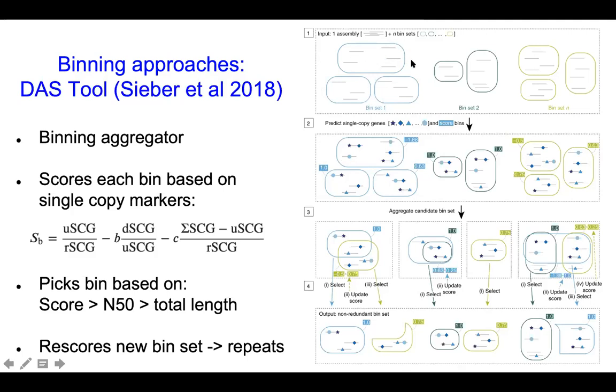The contigs are overlapping between different bins, right? There's one assembly that is then partitioned based on different techniques or tools. So that means that contigs between different binning algorithms can be overlapping, but the bins are separate from one another.